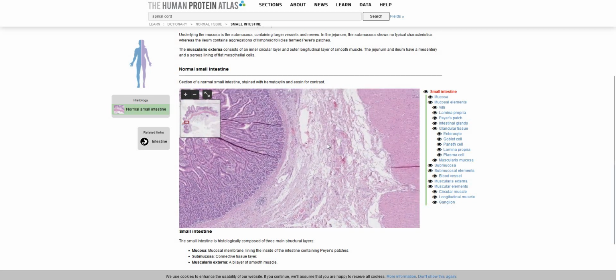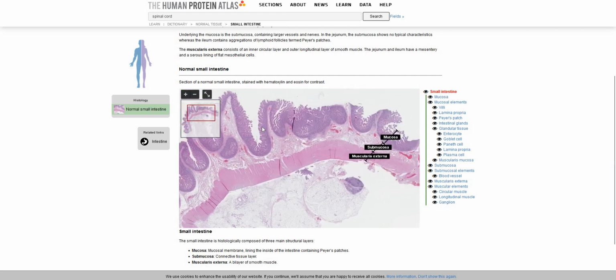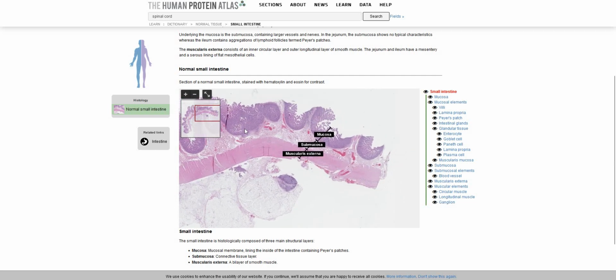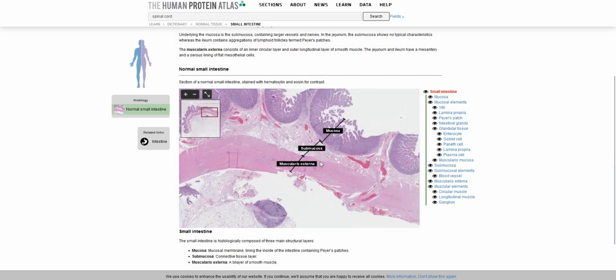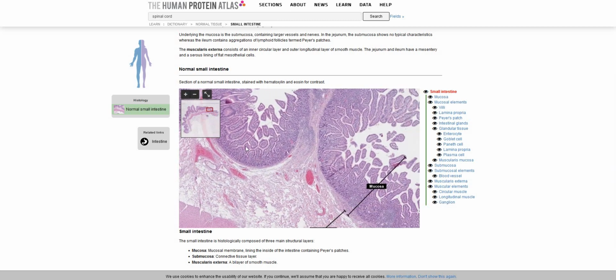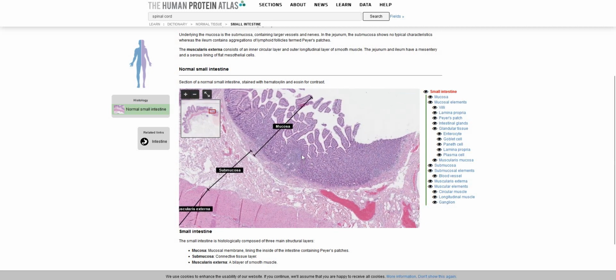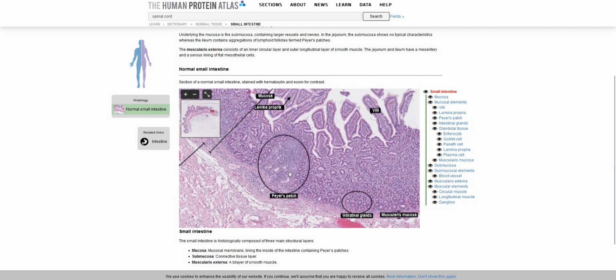Let's go ahead and move on to our ileum. We're going to move down the tube here, and in the ileum, we are looking for a lymphatic structure. I did bring this up briefly during our lymphatic and respiratory lab, but the ileum has a cluster of lymphatic nodules, and in this case we call them Peyer's patches. What we're going to look for on this slide are these darker circular patches, very similar to those lymphatic nodules we saw within the lymph node, and they're going to look a little like this. It's just a slight change in texture and color from the surrounding mucosa.